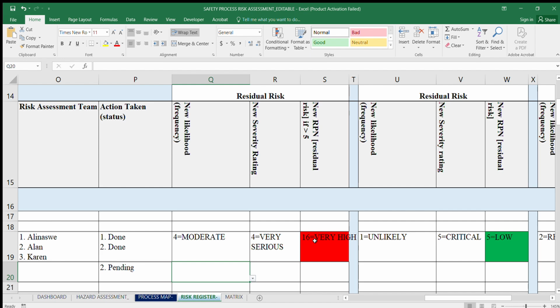But then let's say at this point you've implemented your mitigations. So now after you implement your mitigations, you find that the incidences have reduced. We're not saying you've completely eliminated the incidences. The incidences are still happening, but at this particular point of the review, the incidences maybe have reduced from 5. Maybe you're having like 1 incident, maybe one incident has just happened from the time of your initial review to this second review.